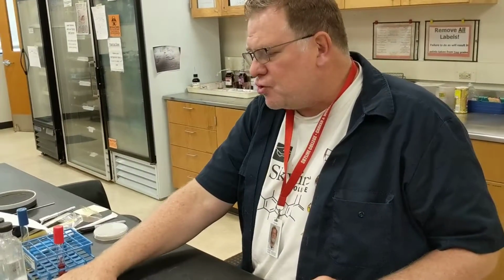Today what I want to do is talk a little bit about the techniques that we will be using in the coming weeks. We will be covering Chapter 9, looking at dilutions, Chapter 11, looking at exoenzymes, those enzymes that are put outside the cell, and then Chapter 12, looking a little bit at carbohydrate metabolism. What I basically wanted to give you is the basic ideas of what techniques you will be using.